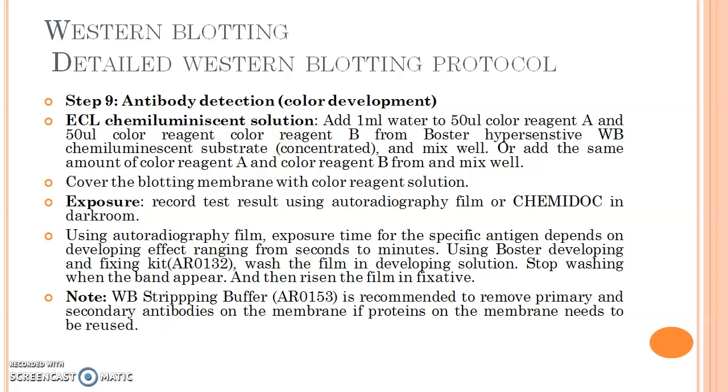Exposure. Record the test result using autoradiography film or ChemiDoc in a darkroom. Using autoradiography film, exposure time for the specific antigen depends on the developing effect, ranging from seconds to minutes. Using the Booster developing and fixing kit, wash the film in developing solution. Stop washing when the band appears and then rinse the film in fixative. Note: Western blotting stripping buffer is recommended to remove primary and secondary antibodies on the membrane if the proteins of the membrane need to be reused.